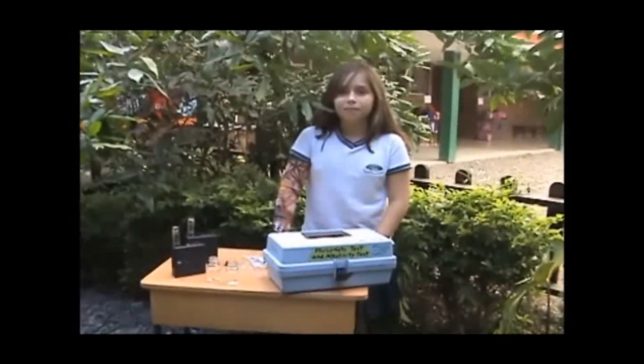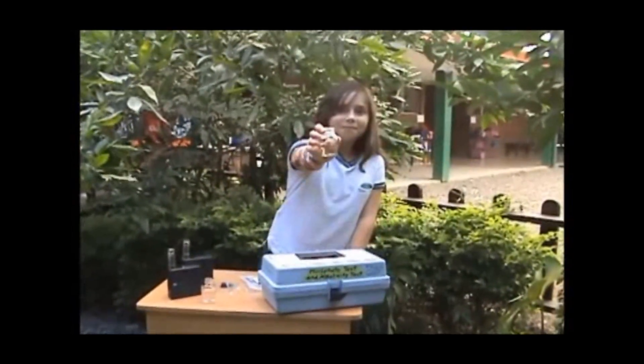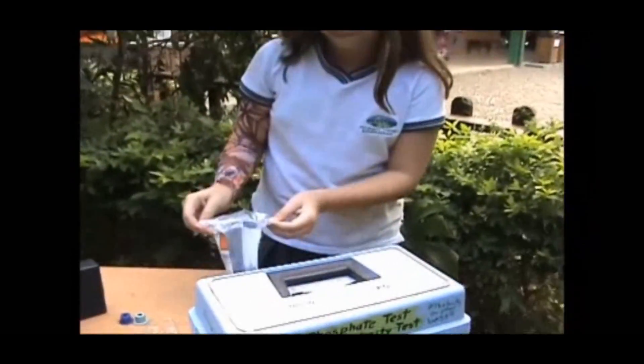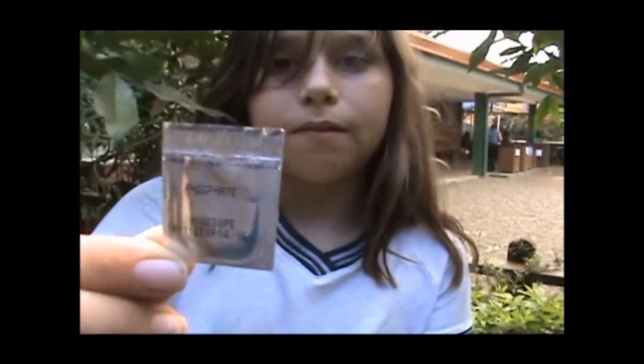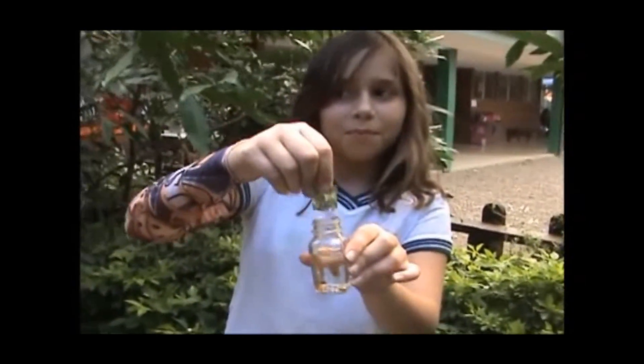Fill the little bottles with water to the 20 milliliter mark. Label sample A and B. Add one PhosVer 3 phosphate reagent to each bottle and mix. Wait for eight minutes.